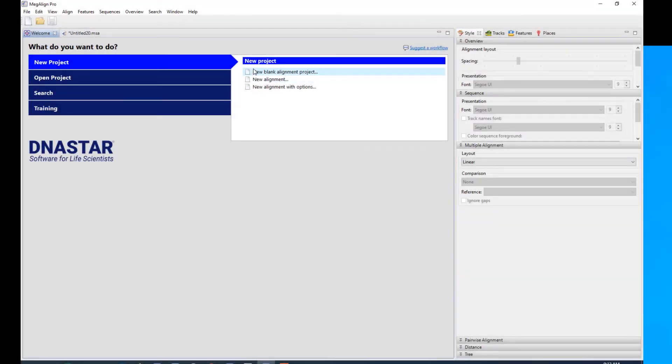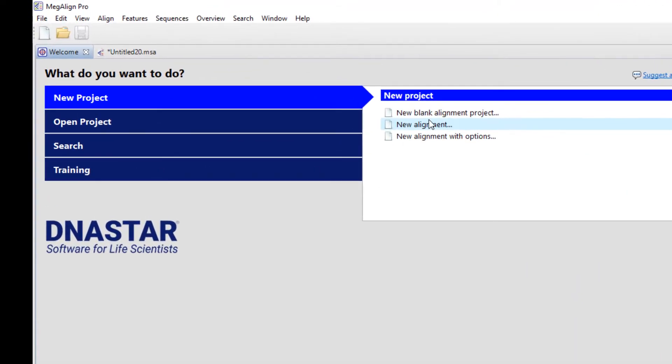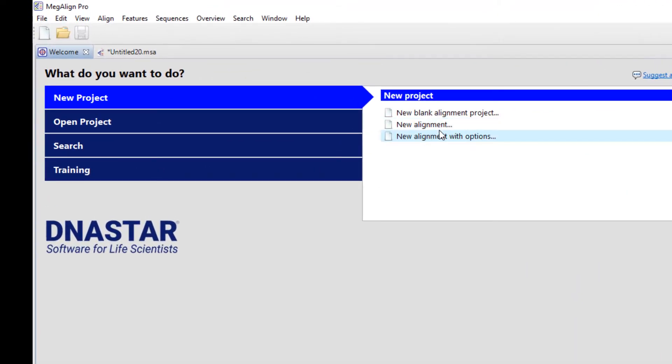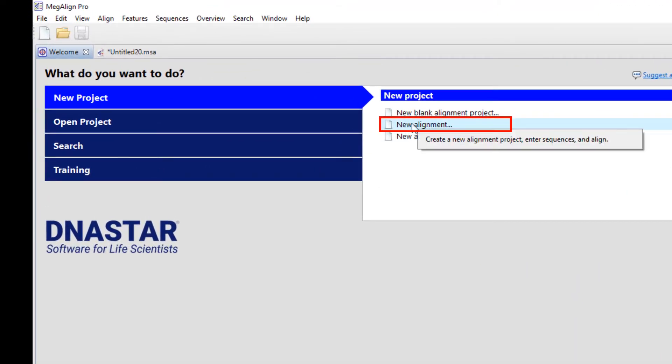So as far as starting a new project, that's pretty much the basics. There are two little minor shortcut options here. One is new alignment.